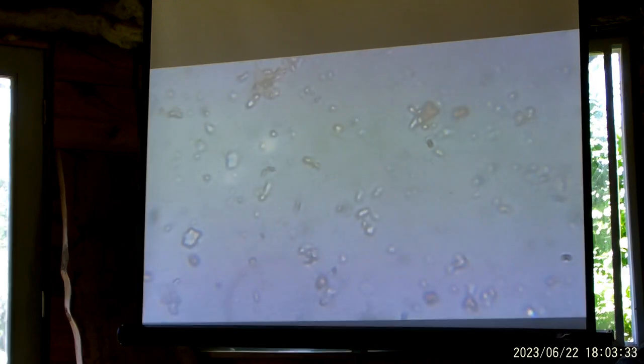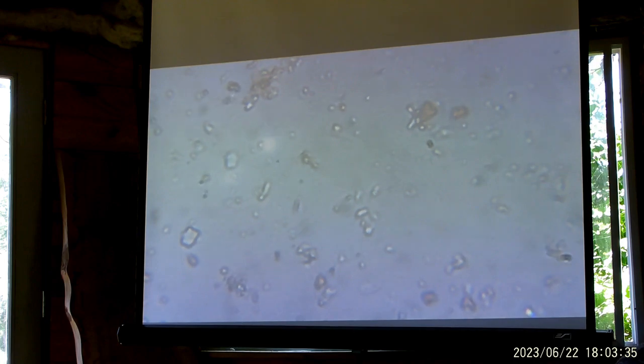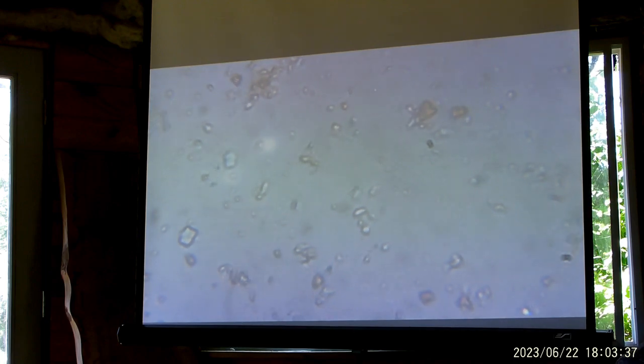And compost, soils under the microscope are typically the most boring things that we look at. Good quality compost, you can see a lot of activity. No wonder. Going back to Dan's presentation this morning, it's pretty apparent that most of our soils are beat up. And it correlates with all of their research, because most of the soil that we look at ain't that exciting.